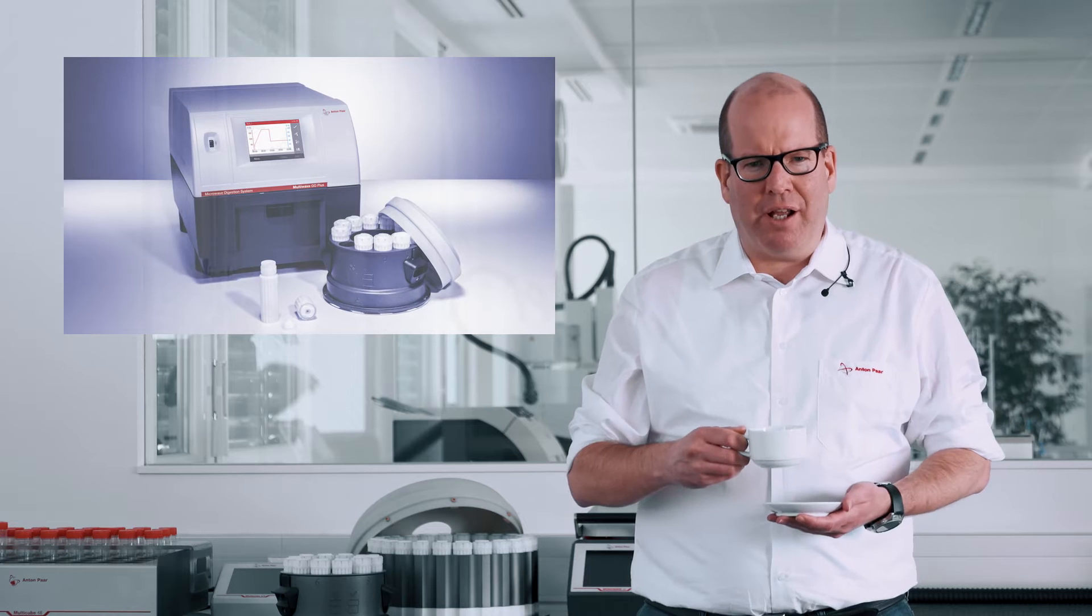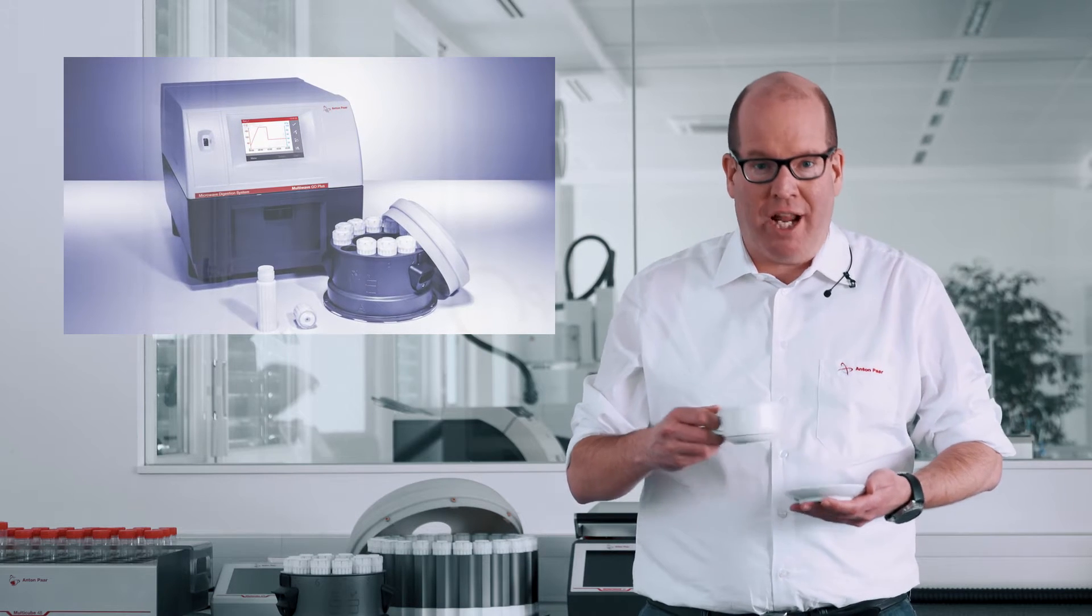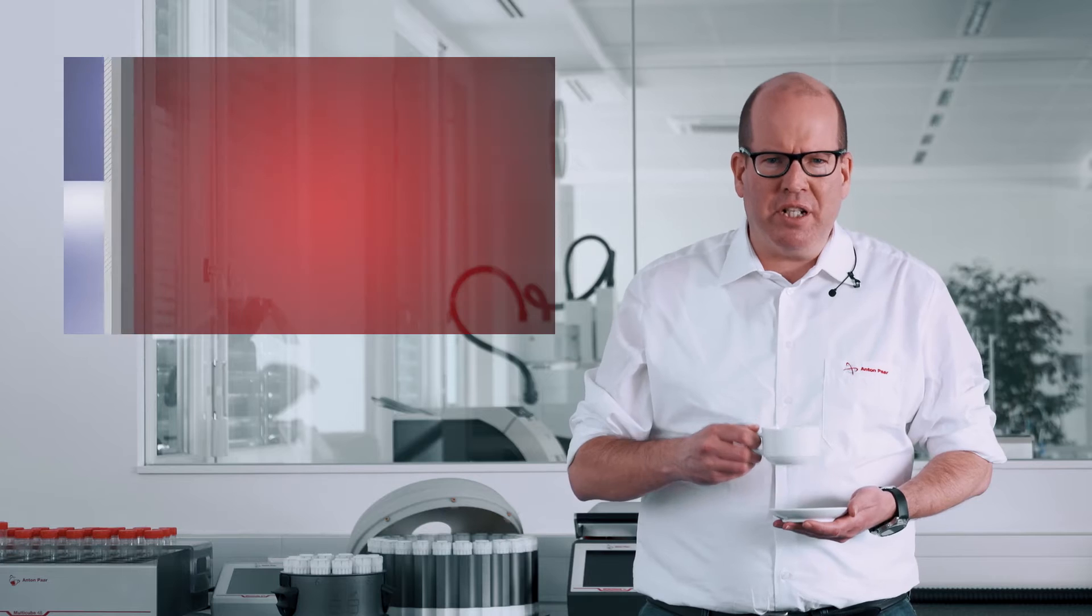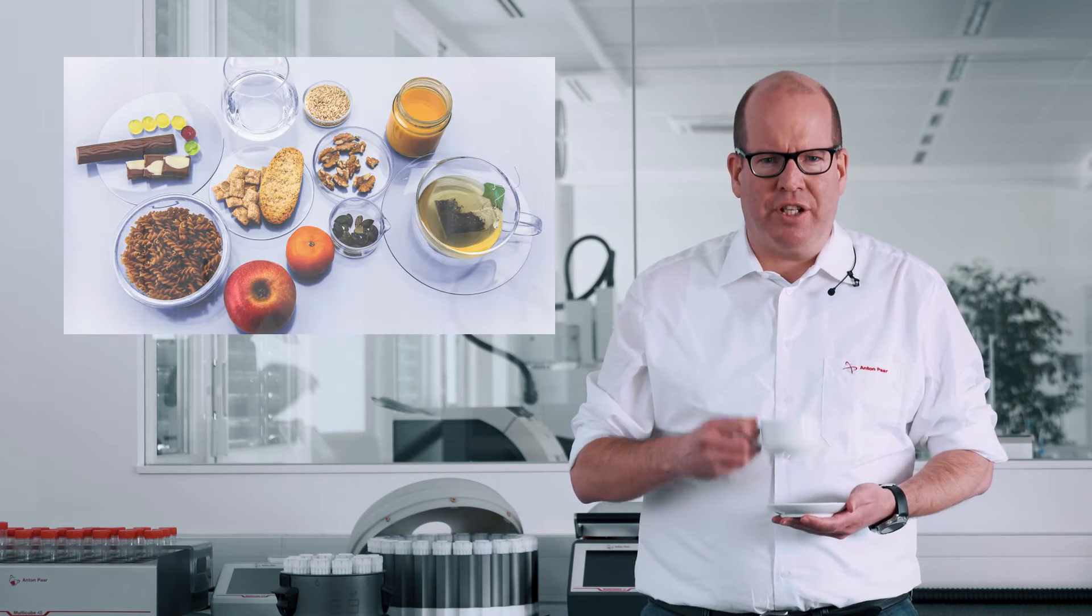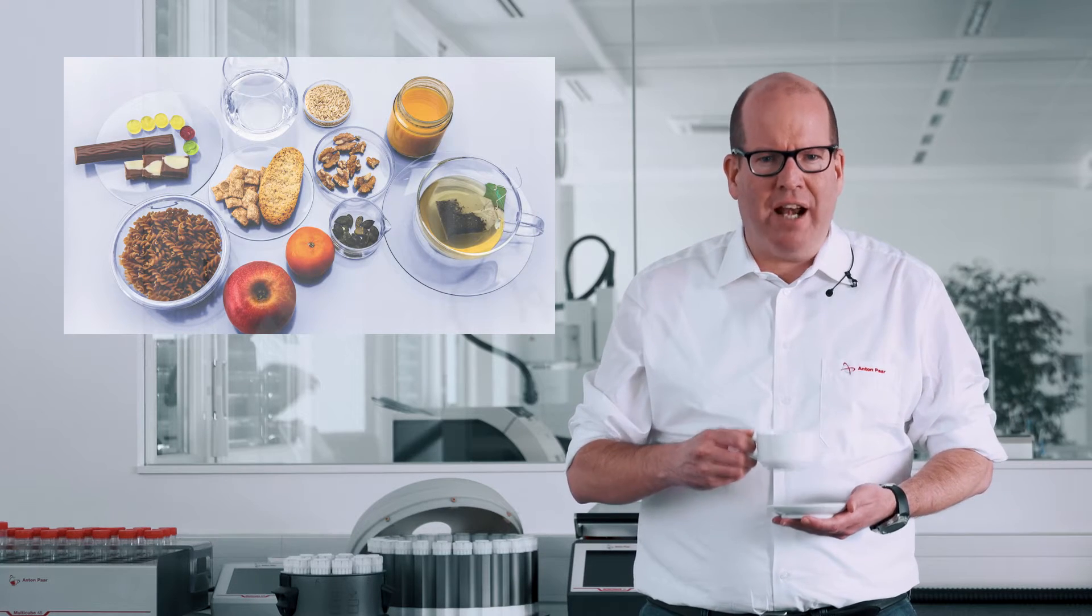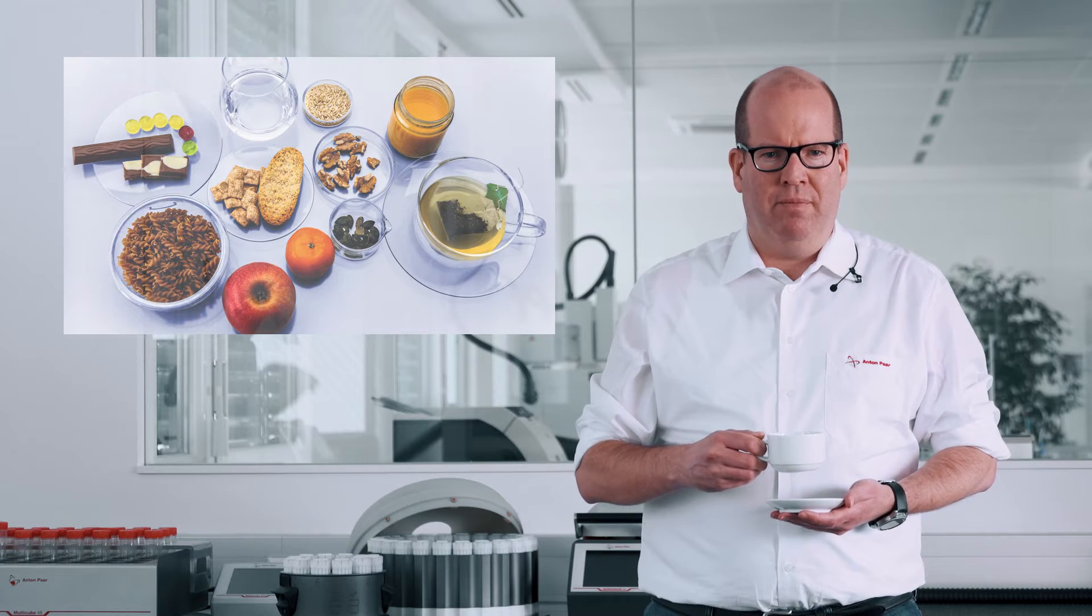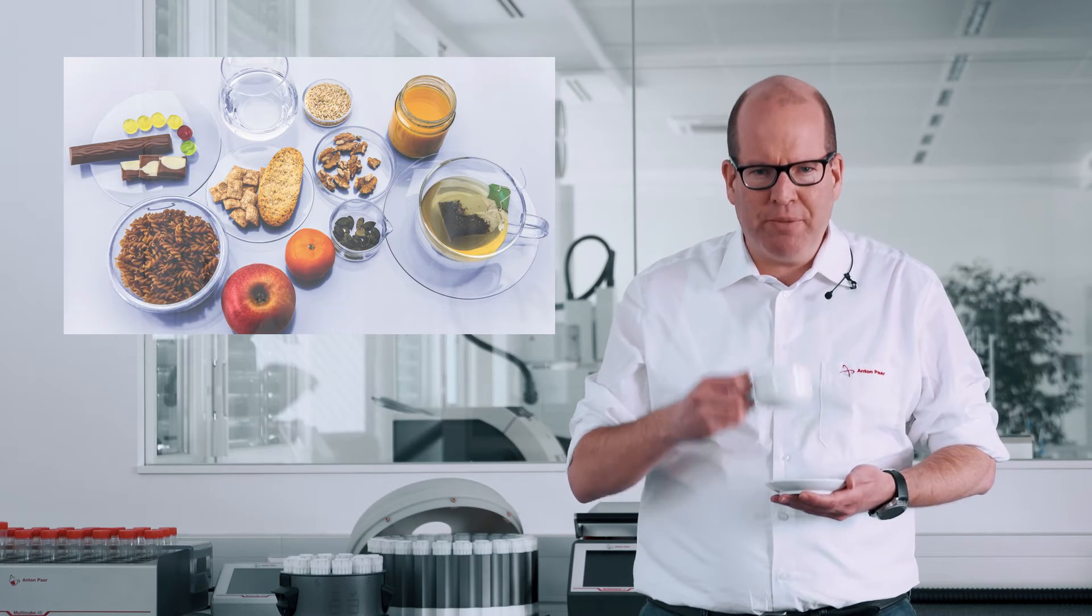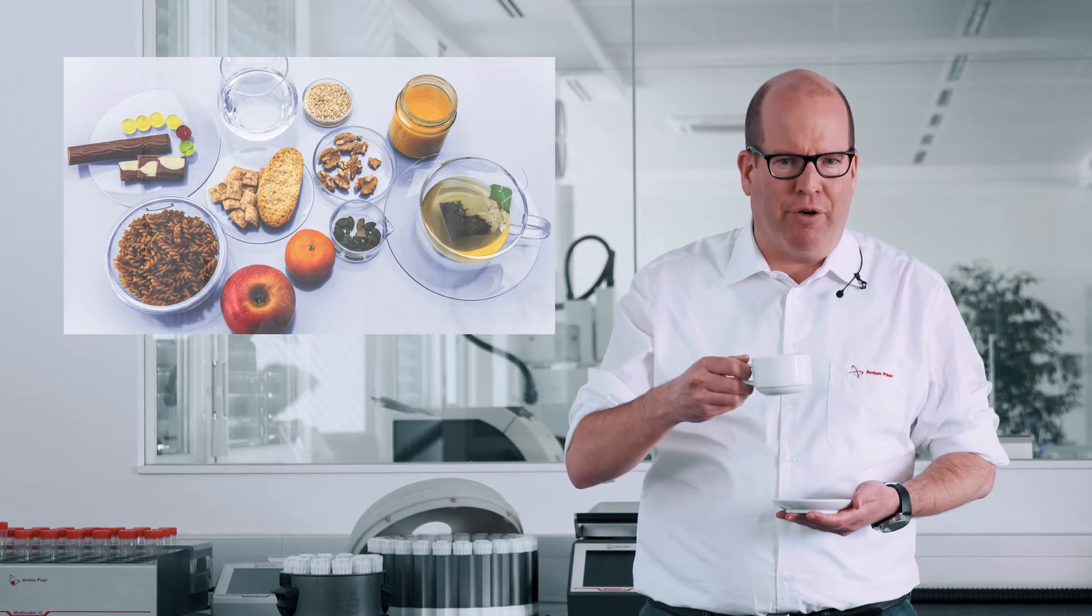Anton Parr's Multi-Wave Go Plus helps us check for them. The instrument is perfectly suited to the digestion of food and environmental samples. What we're going to do is boil some coffee a different way.